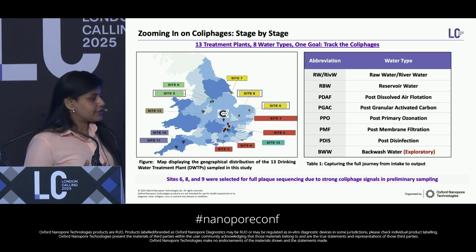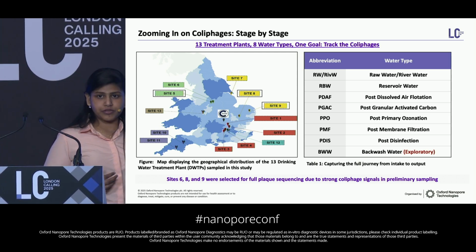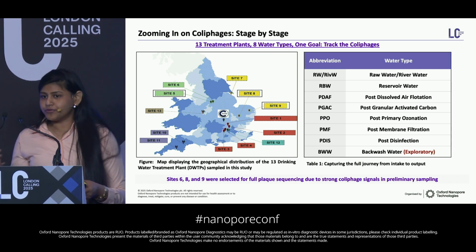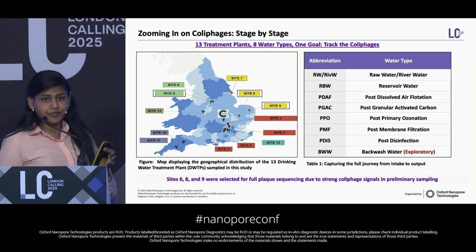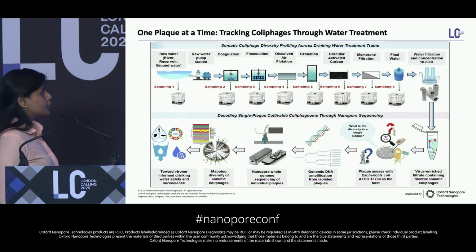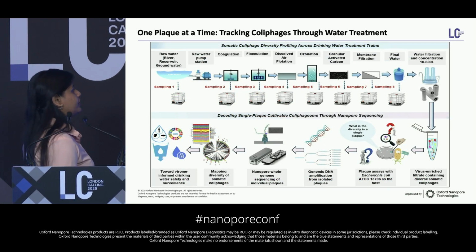We were also interested in the backwash water, and we explored it as well, in order to see which different types of coliphages are being trapped and how they change with the different treatments. So this is a snapshot of what we did.